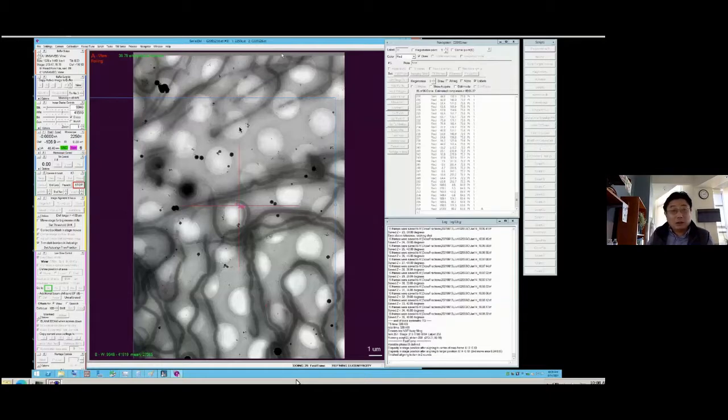Again, this is a real imaging session that I pre-recorded a couple of days ago. You can see the interface with the image in the middle. This particular image happens to be a low-mag image. As I go back to here, there's this called View, and the Focus, Trial, Record. This is what we call View mode.